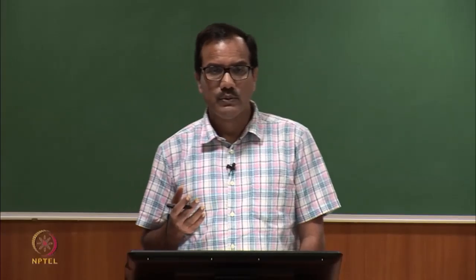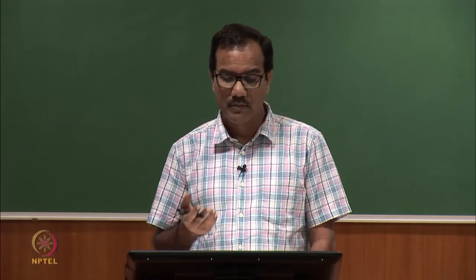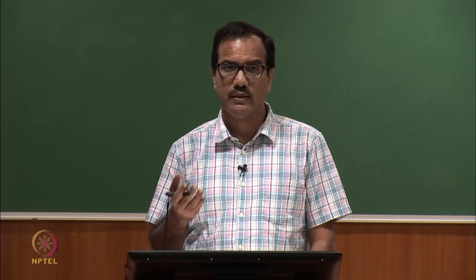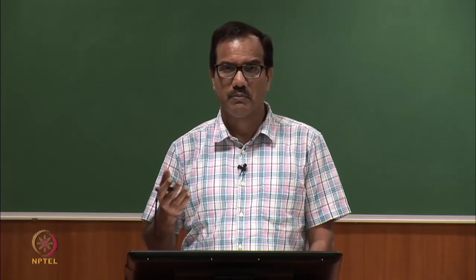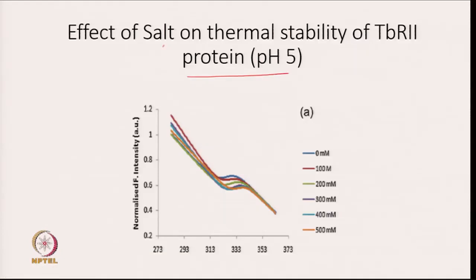We can also look at the effect of salt. This is one of the experiments done to look at the effect of salt on the thermal stability of a protein called transforming growth factor. The data is obtained at pH 5. What you can see is that this is at 0 molar, and this is at around 500 millimolar.